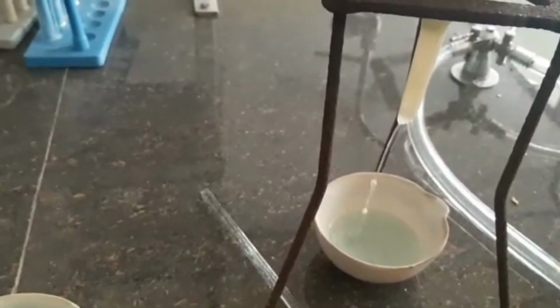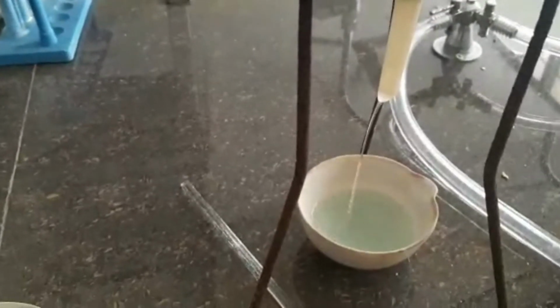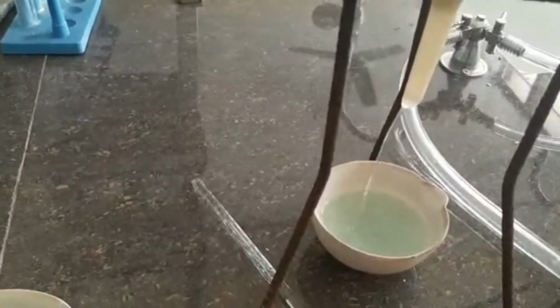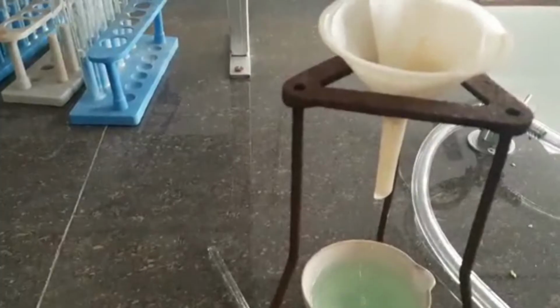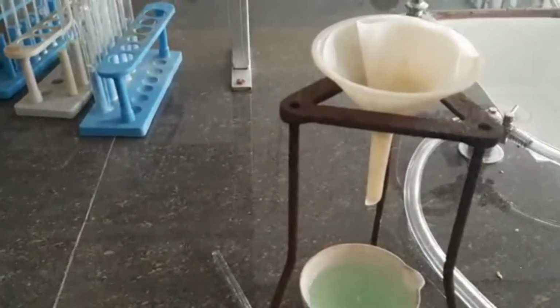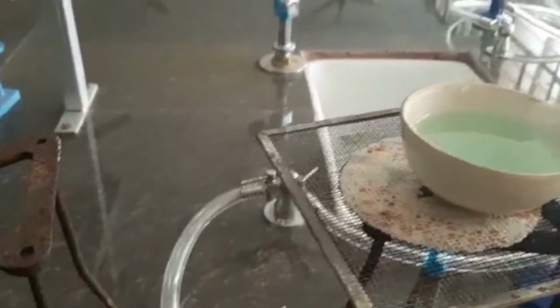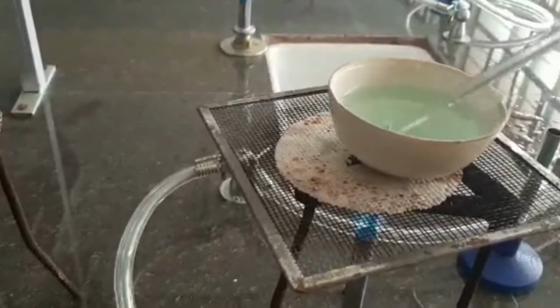and heat it till crystallization point is reached. Heating is done till crystallization point is reached, and then the solution will be cooled to separate the crystals. Avoid filtering very hot solution through the filter paper, because that may tear off the filter paper. So we will boil the solution with constant stirring in order to allow it to concentrate.